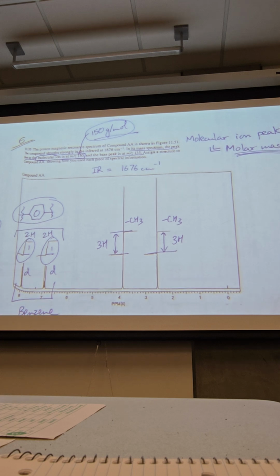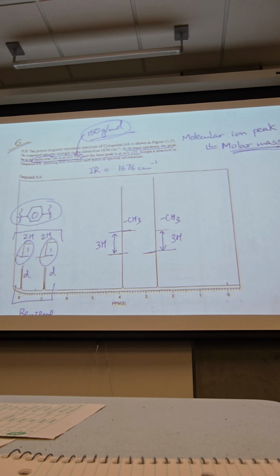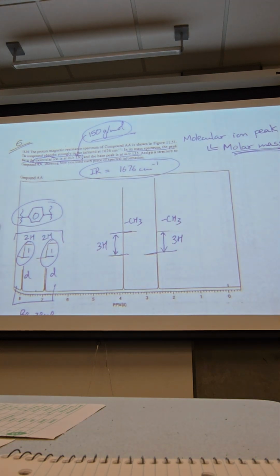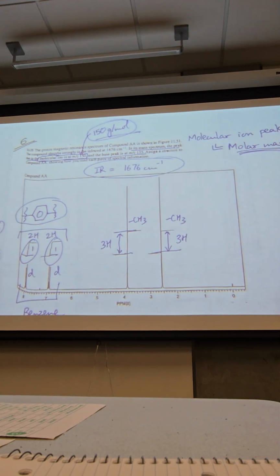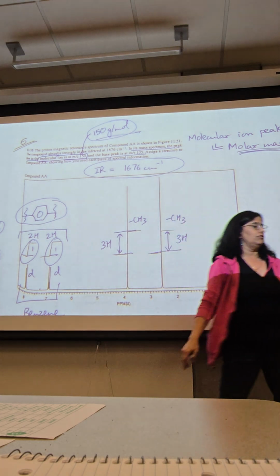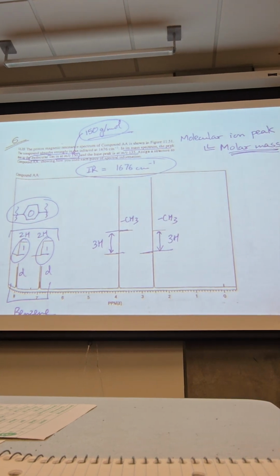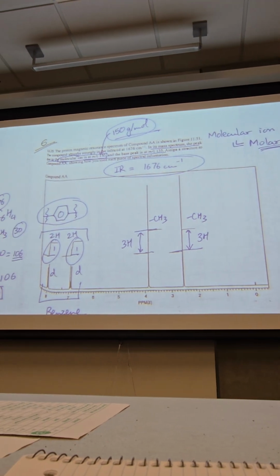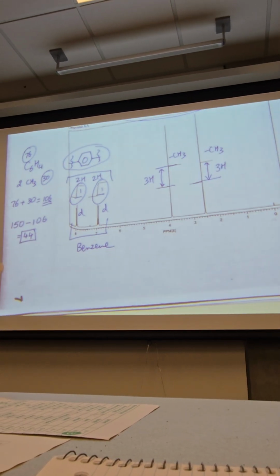Everybody okay? But it can't be a carbon with hydrogen, because there are no more carbon-hydrogen signals here. Also this IR. Sorry, I misspoke. It cannot be something with hydrogen on it, because there are no more hydrogens for us to account for. It'll have to be something with oxygen. It can also be carbon, just not with a hydrogen. Cannot have hydrogen on it.